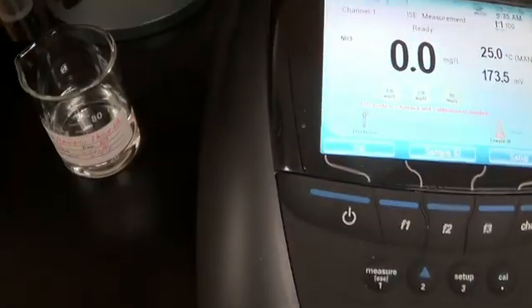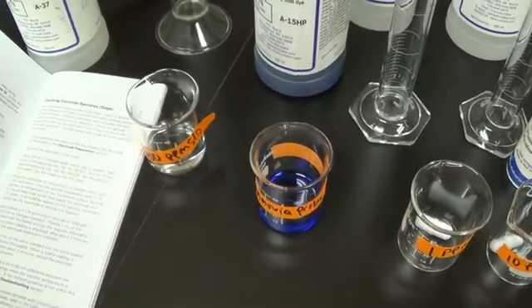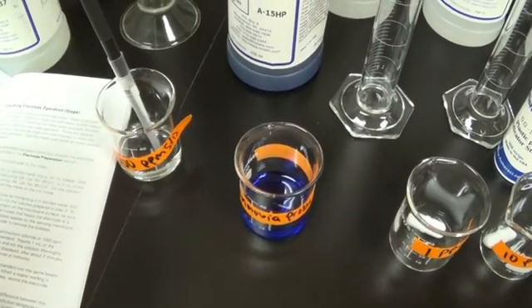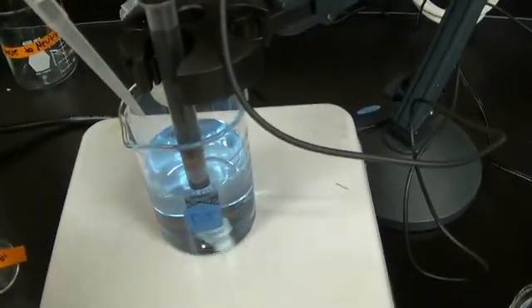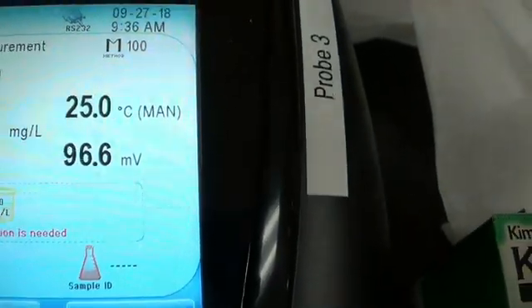Take the probe which is in the storage solution, dip it in DI water. And then I'm going to add 1 ml of the 1000 ppm standard. Wait for the millivolts to stabilize. It is now ready. The millivolts 42.6. I'll write that down.